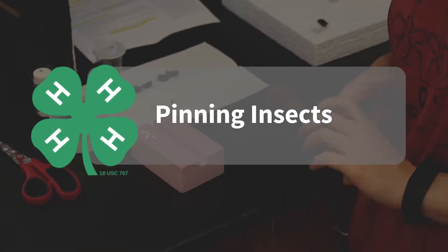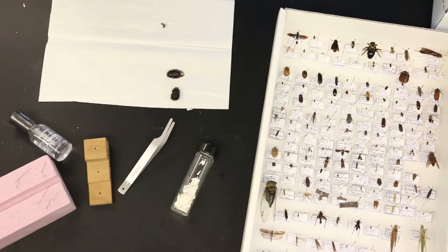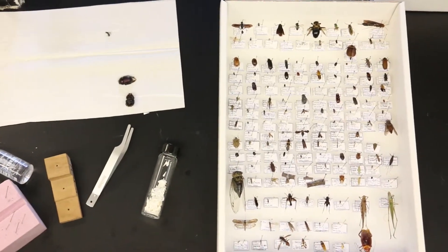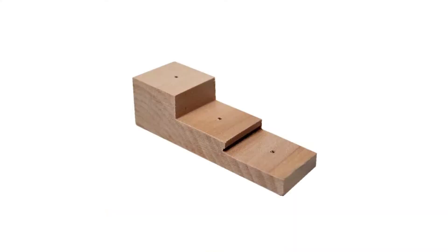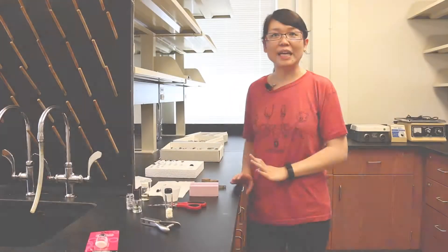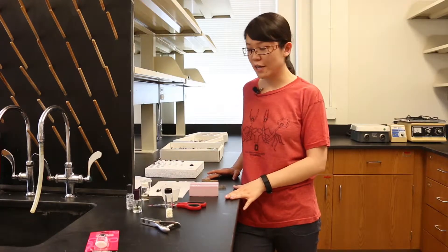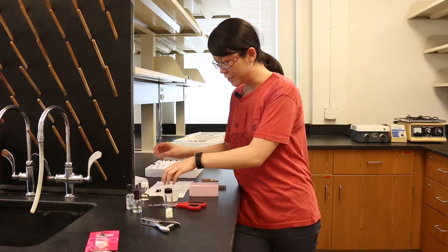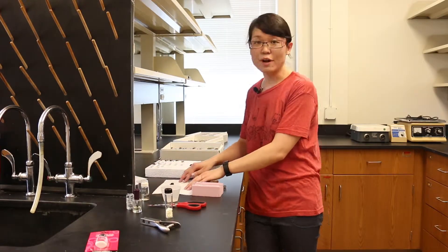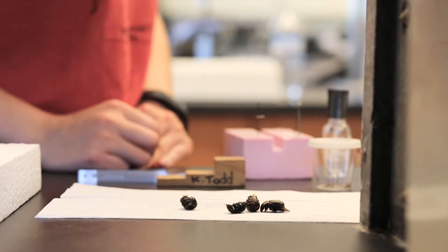First, we'd like to talk a little about pinning insects. The tools we need include soft forceps, a pinning block, styrofoam, and insect pins. Normally before we start pinning insects, we keep insects in a freezer to keep them fresh. After we take them out, we normally air dry them for at least 20 minutes on a piece of paper towel like this.